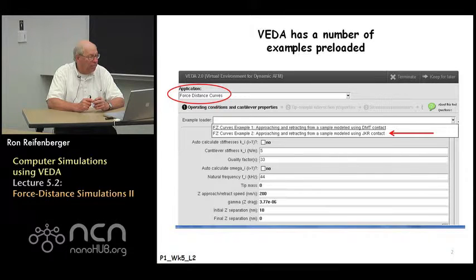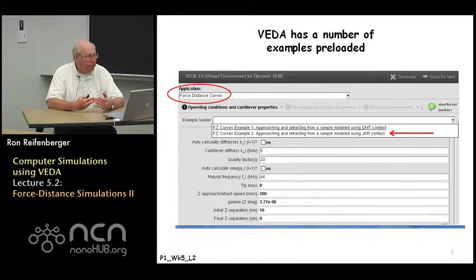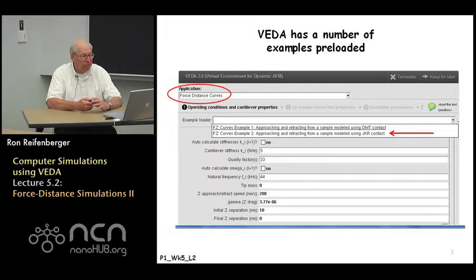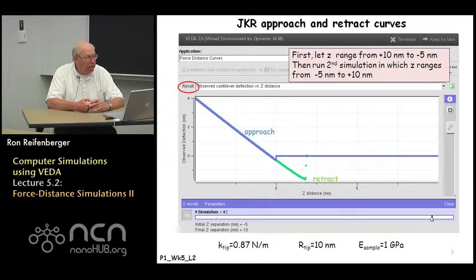Select the preloaded example: approaching and retracting from a sample using the JKR contact model. When you select that particular preloaded example, a variety of parameters are already loaded into the VEDA software so you do not have to adjust anything. You can directly go to the simulate tab, press simulate, and you'll see JKR approach and retract curves for the default parameters listed.